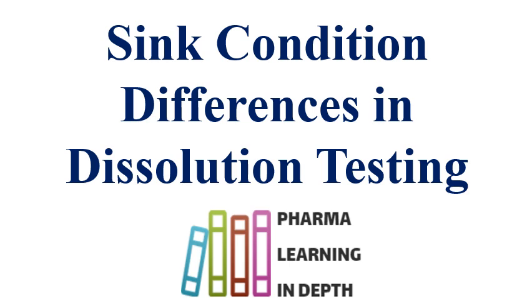So, you might have come across a situation where the dissolution release or dissolution test shows a difference in the release rates between higher strengths and the lower strengths.